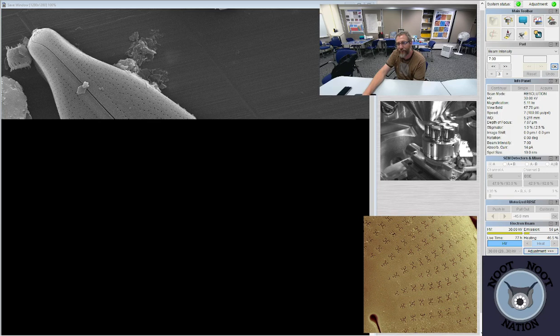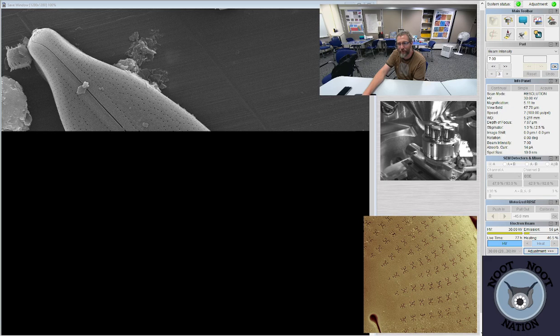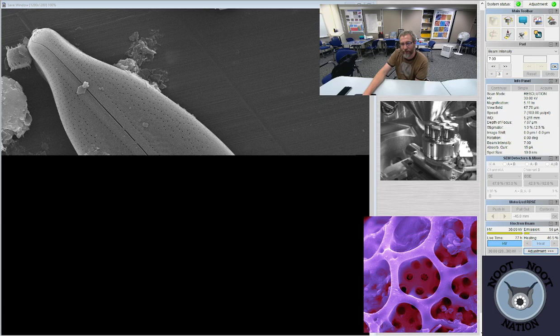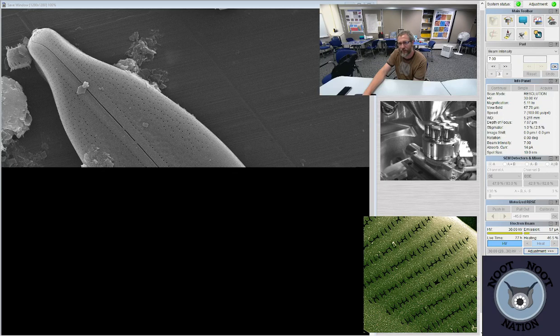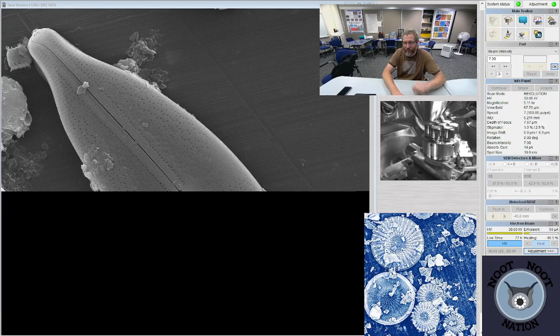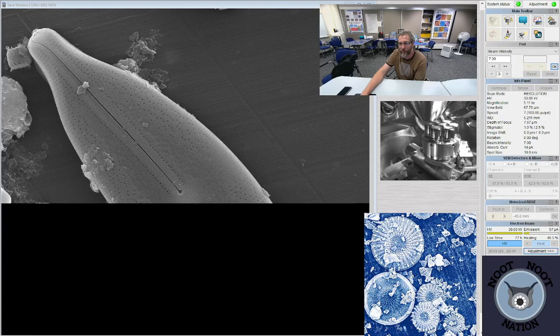I just got here. What's the name of that organism? I don't know which one you wanted. This is a diatom. We're looking at all diatoms. This one is Anomoeoneis. I think it's sphaerophora, but I'm not positive about that. Is that the sample edge? It's the edge of the stub. I got all this stuff from my friend Pacific Plankton, who streams on Twitch, and she sent me the material through the mail. They are diatoms, yes. You'd like to see a video of how the samples are prepared.